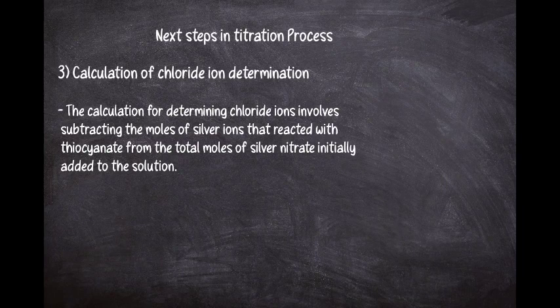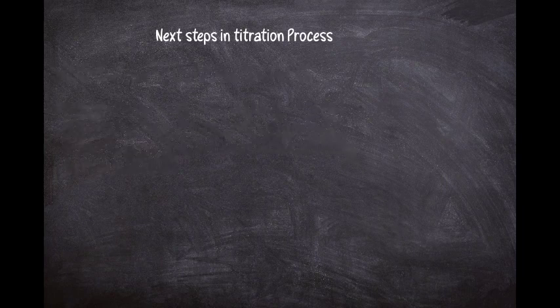In summary, the titration process in Volhard's method is a carefully orchestrated series of reactions that culminate in the formation of a distinct endpoint, allowing us to accurately determine the concentration of chloride ions in the solution.